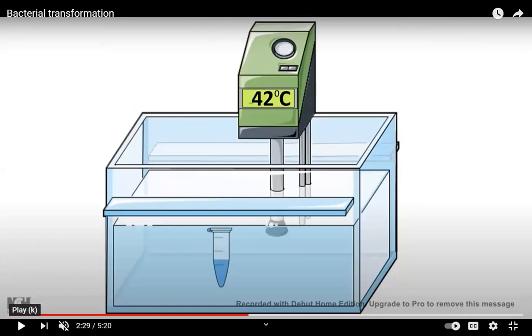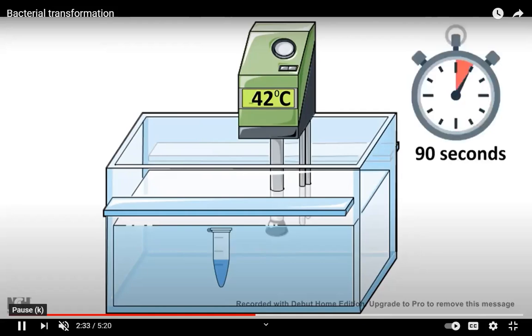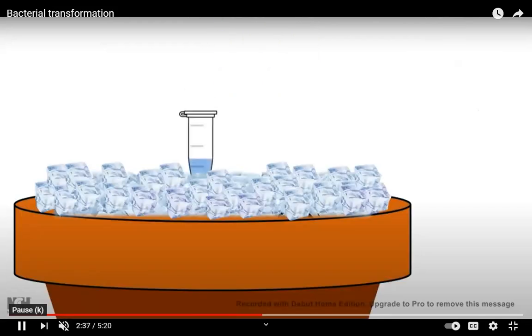Now, heat shock sounds just like what it sounds like. We're going to submerge it in a warmer bath, and with this, it's going to create that shock that's going to break up the plasma membrane itself. The heat shock happens very quickly, and then we're going to cool it back down so that the membrane can essentially heal itself.